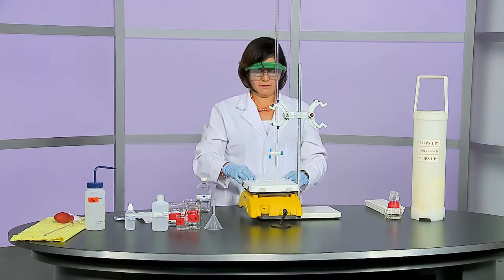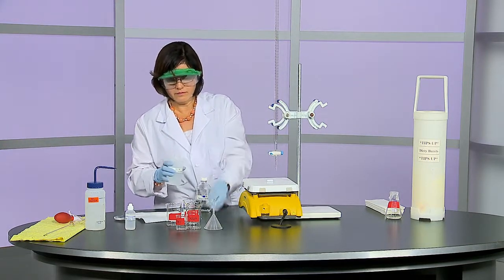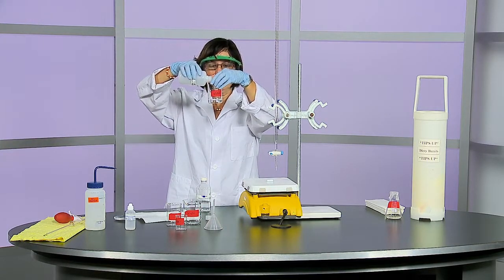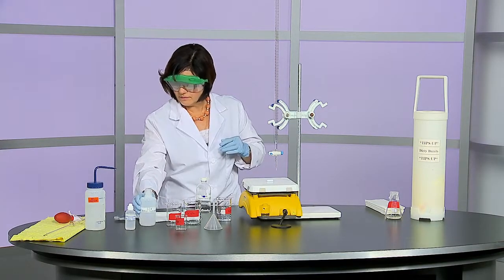Pour sodium hydroxide into a properly labeled beaker. The experiment should state the volume needed. Cover it with a watch glass to prevent contamination.